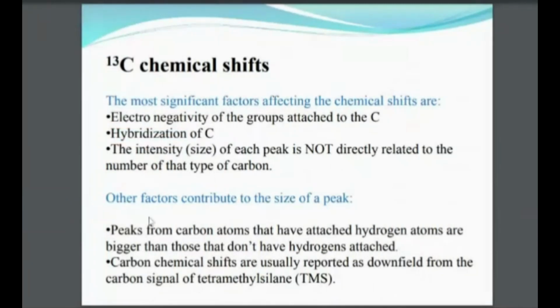See, other factors also contribute. Peaks from carbon atoms that have attached hydrogen atoms are bigger than those that don't have hydrogen attached. So this is one observation. Carbon chemical shifts are usually reported as downfield from the carbon signal of tetramethylsilane. So it is bound to happen. It has to be downfield.